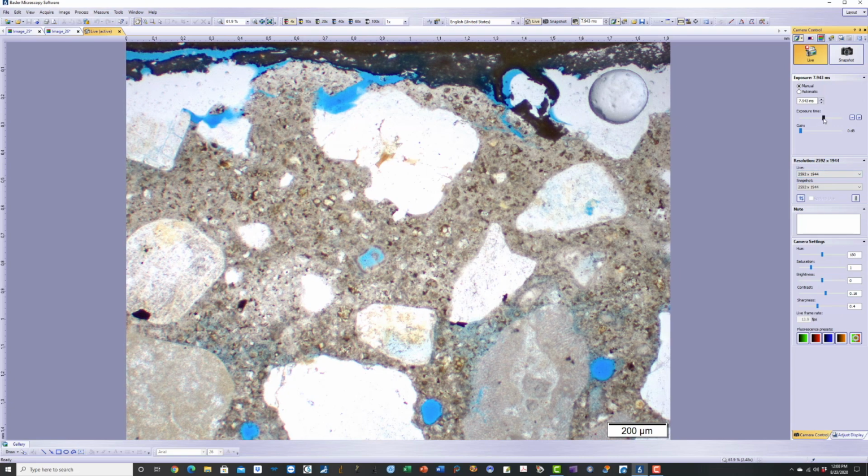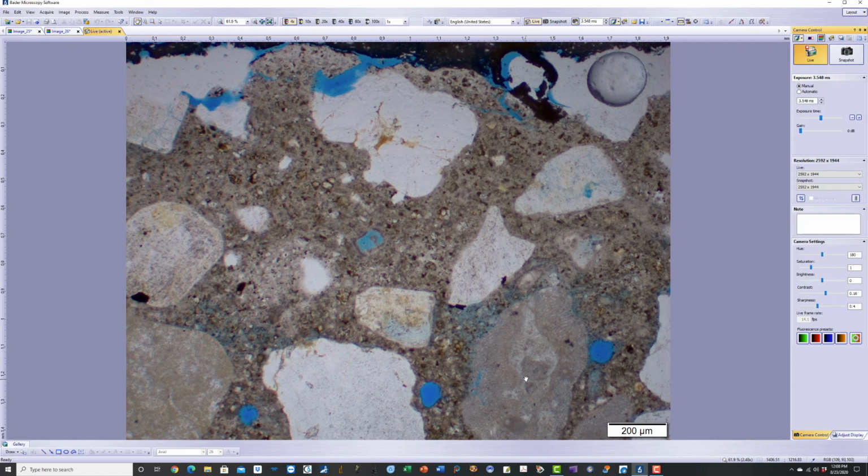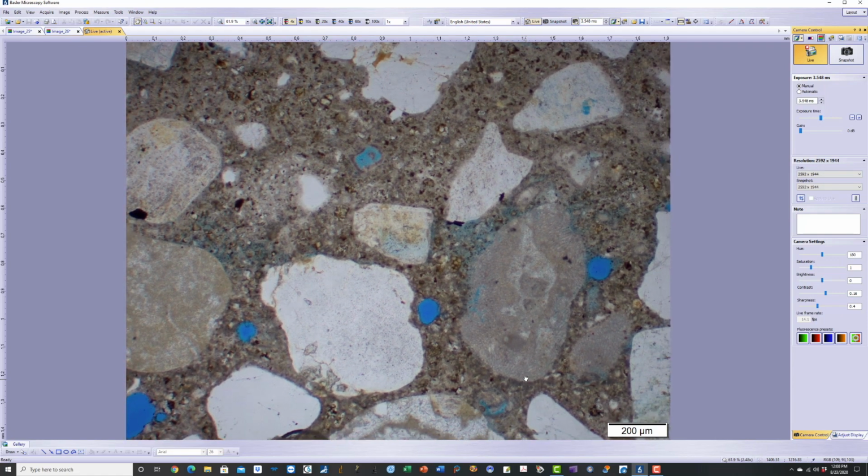You can see it's a very dense paste with a lot of residual cement particles. You can see the belite with ferrite interstitial, spherical belite clusters with interstitial ferrite, the alite grains. So all the residual cement particles and the cement hydration products are present. And this mortar has silica sand and seashell. It's a mixture of silica sand and seashell. Being in Puerto Rico, seashell is a common ingredient used in the sand.